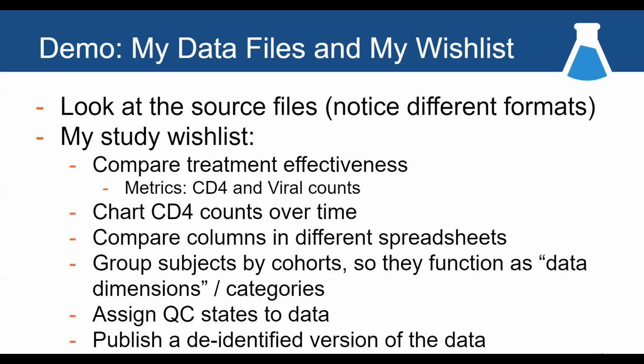It's not real data, but it's really inspired by real events in HIV research. I have here 6 different data sets. The first one is a demographics data set. It's a tab-separated text file, and it gives me little profiles of 12 different participants.